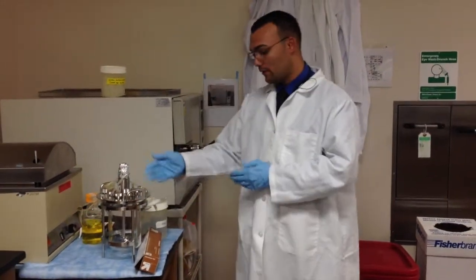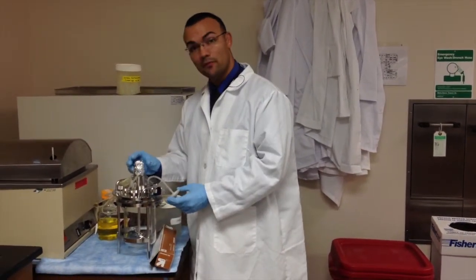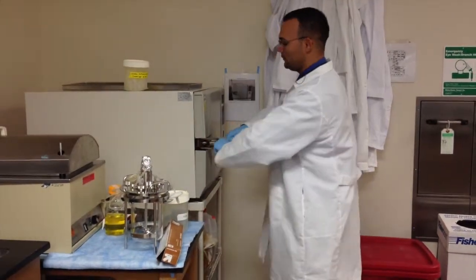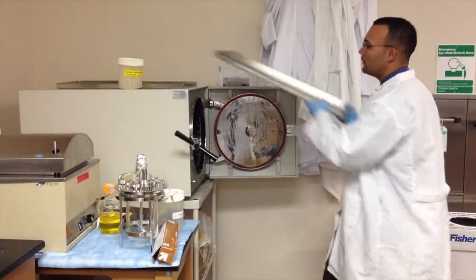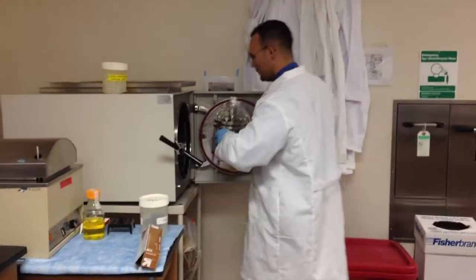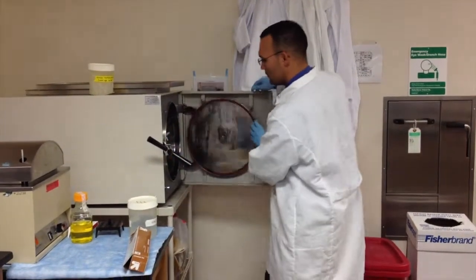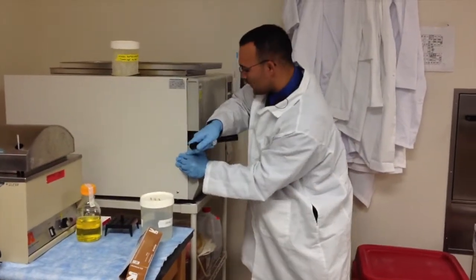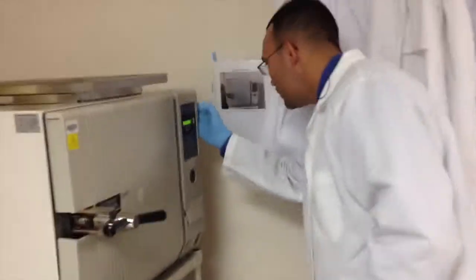Alright, now we're going to autoclave our bioreactor. So the first step is we're going to cover any opening ports with aluminum foil, like so. Okay. Now for the bioreactor, we're going to open the door lid here. Take out any trays that are in there already. Put it in the bioreactor. Close the autoclave, tighten it up, and we're going to put it in the dry cycle.